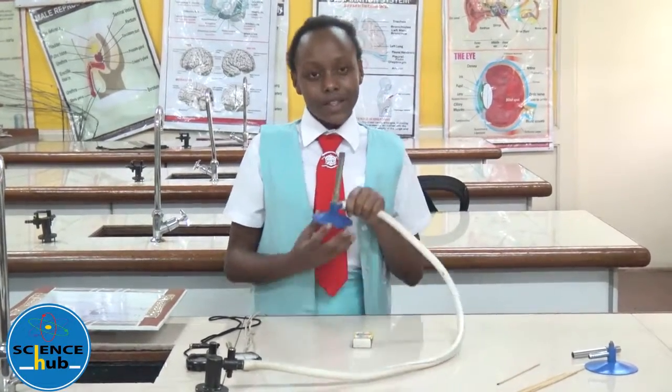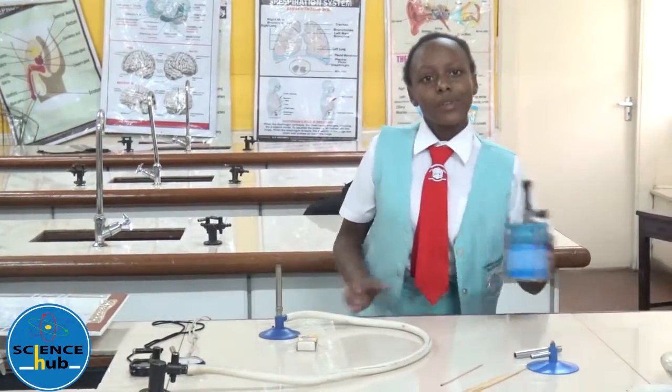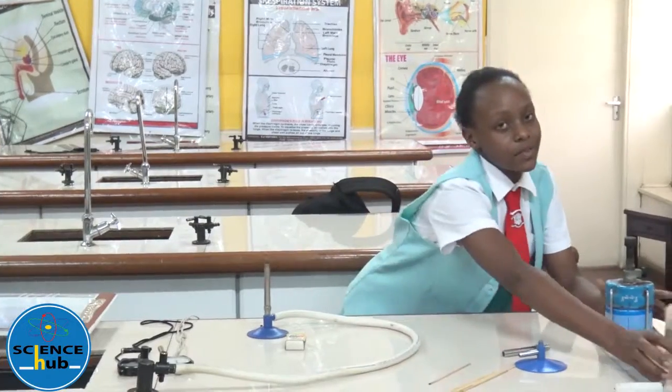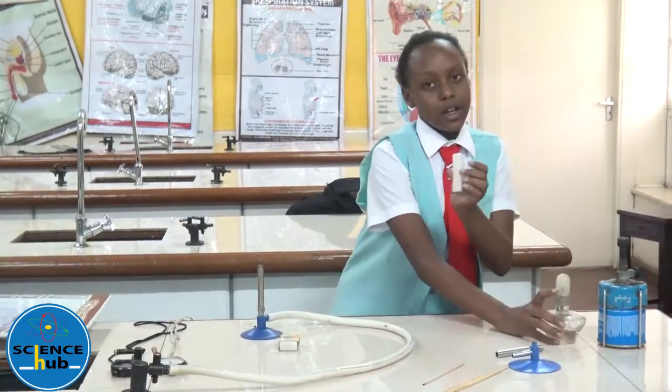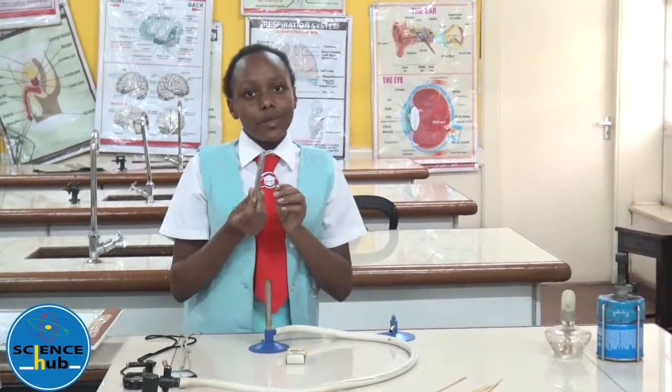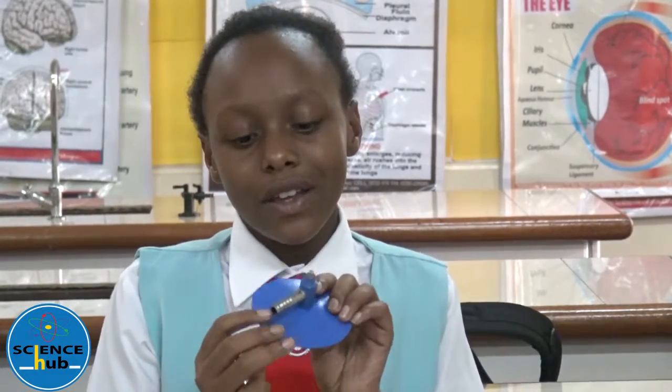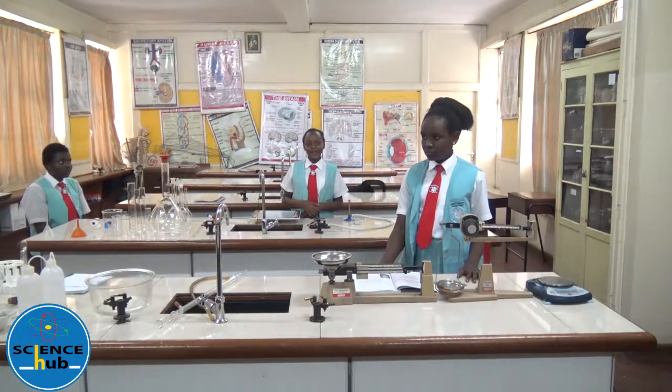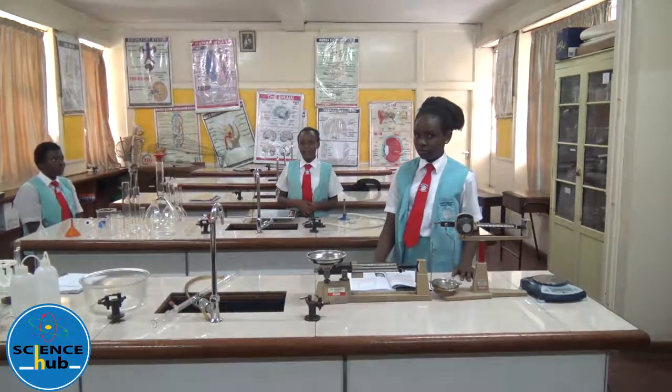Here are the apparatus that are used to produce fire or heat. This is a Bunsen burner, this is a portable Bunsen burner, this is a spirit burner, and this is a candle. The Bunsen burner has different parts: this part is called the chimney, this small ring is called the collar which closes and opens the air hole, this small hole is the air hole, this part is the jet, this is the gas inlet, and this is the base or stand.